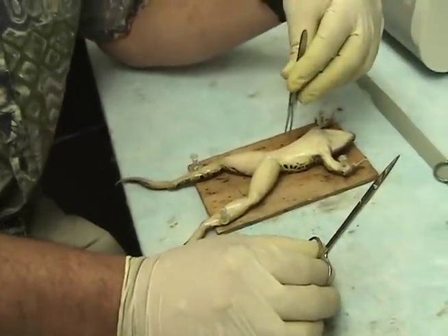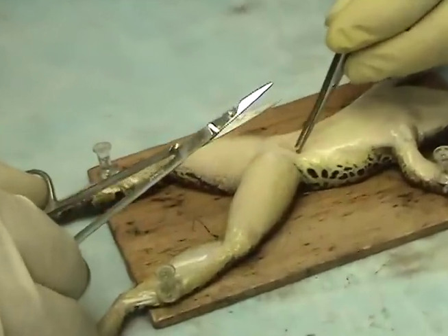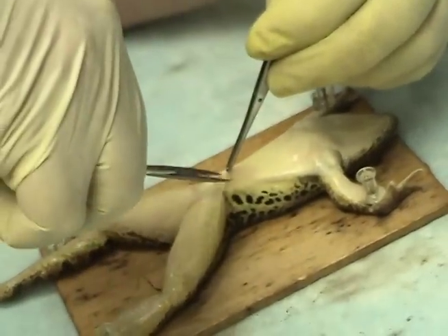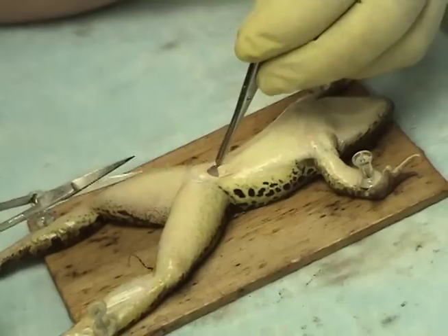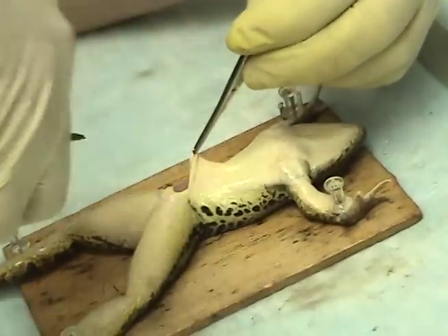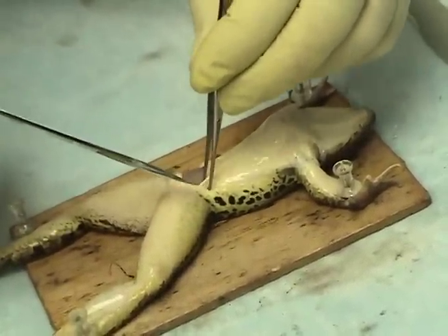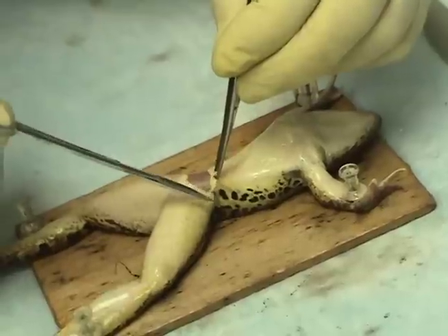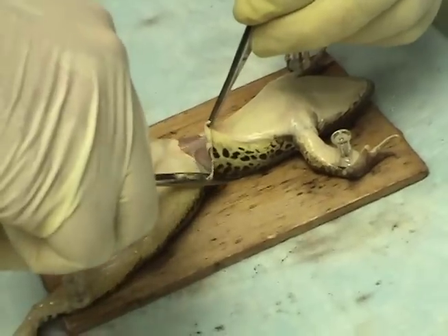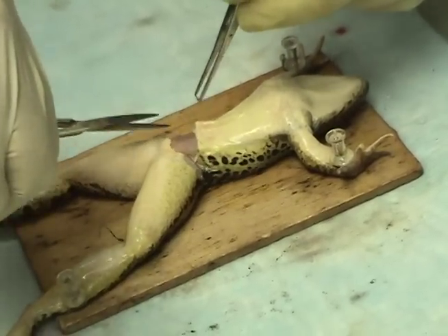That's a light artist, thank you. One thing about frog skin — there's a lot less connective tissue attaching it to the rest of the frog than there is, say, in a mammal.